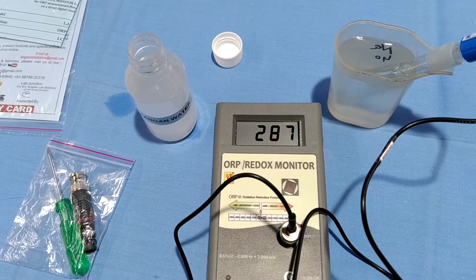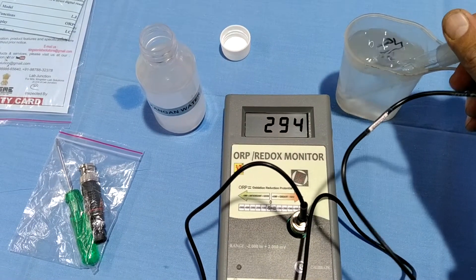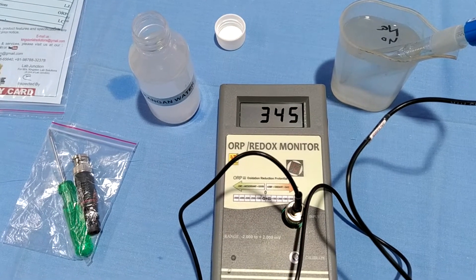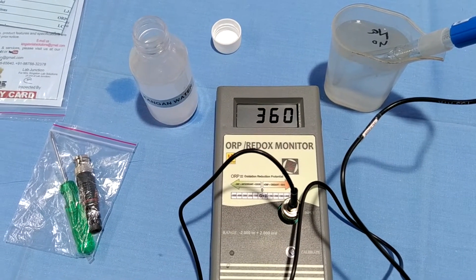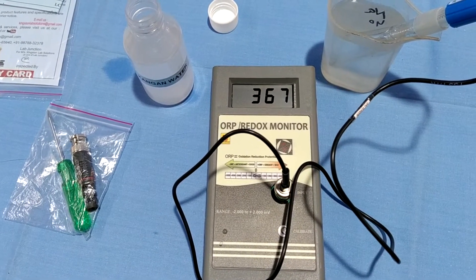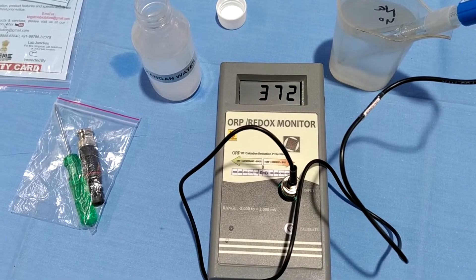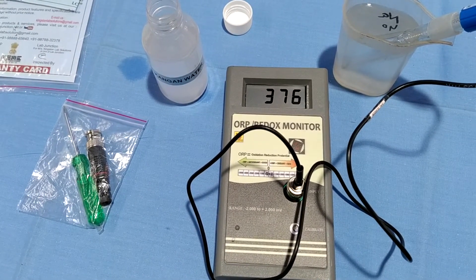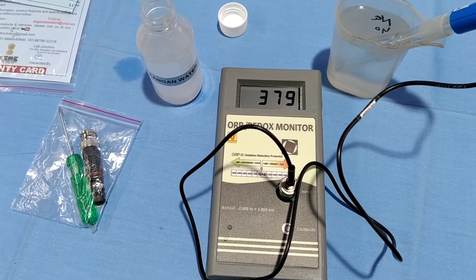The reading goes to plus 286 to 290 — this is a bad sample. It increases above 350. This is a bad sample. Directly plug and play and check the result.